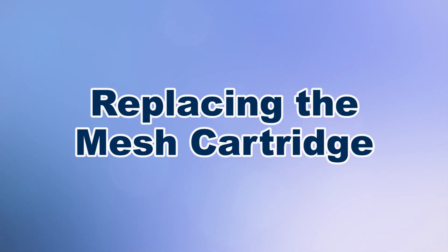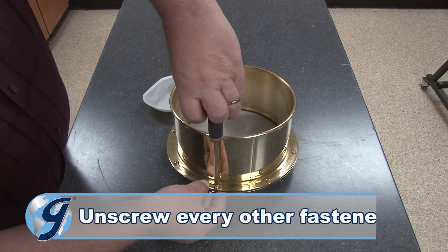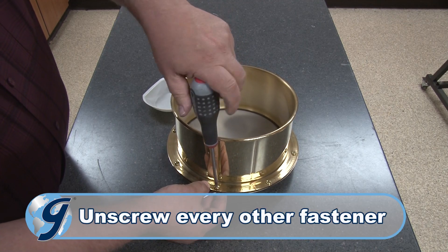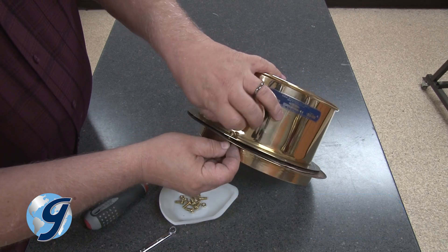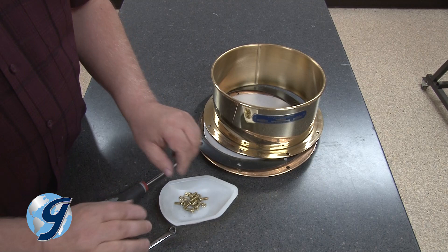To replace the mesh cartridge on your replaceable mesh wet wash sieve, first place the sieve on a flat surface. Next, unscrew every other fastener securing the cartridge within the sieve frame. Then continue removing fasteners that are opposite each other — removing fasteners this way will hold the unit together until you're ready to separate the top section from the bottom.